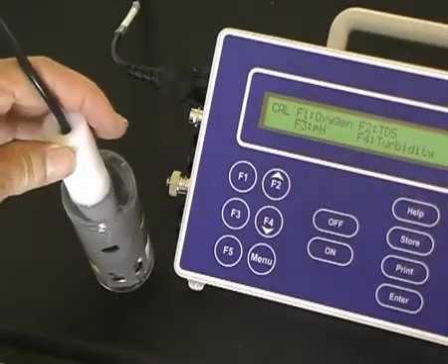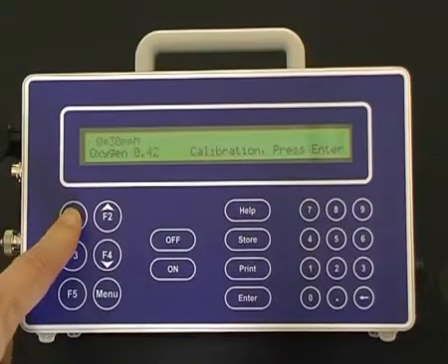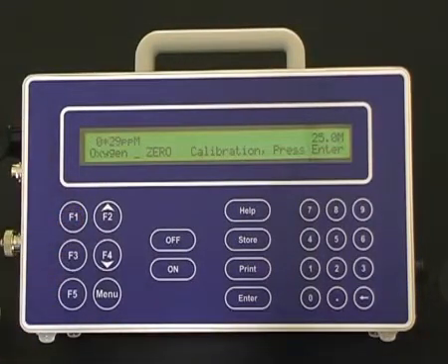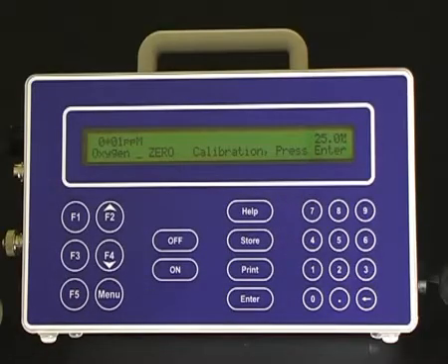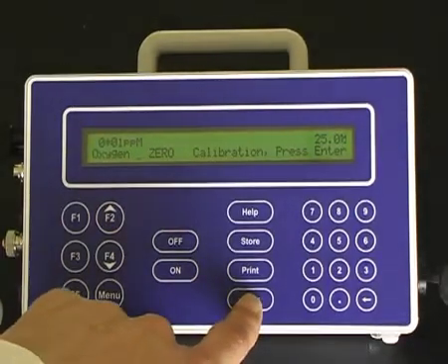Allow it to equilibrate. Press F1 to calibrate oxygen. Allow sufficient time for the dissolved oxygen sensor to equilibrate to a zero. This may take three to five minutes. Once the dissolved oxygen sensor has equilibrated in the zero solution, press the enter button to calibrate the zero point.